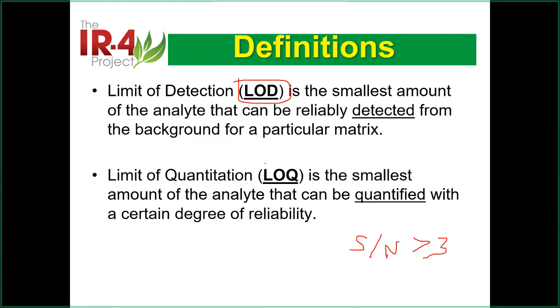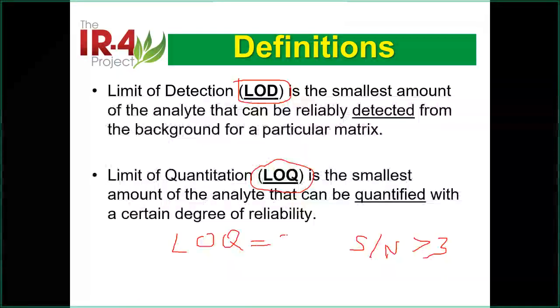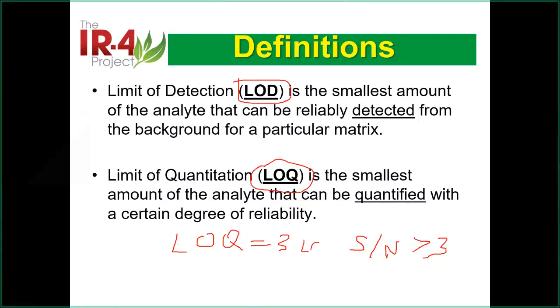So in the IR4 system, we do the calculation. Okay, this is calculated. And typically, this is 3 times LOD, typically. It depends on the definition because scientifically it's different. Okay, so this is how we calculate that. If you really look into statistical theory, that could be another 2 hours to keep talking about that.